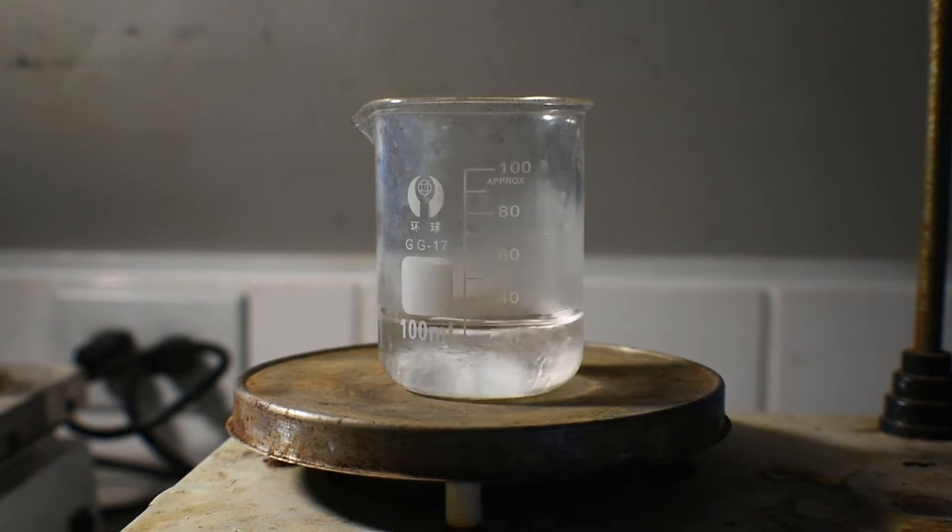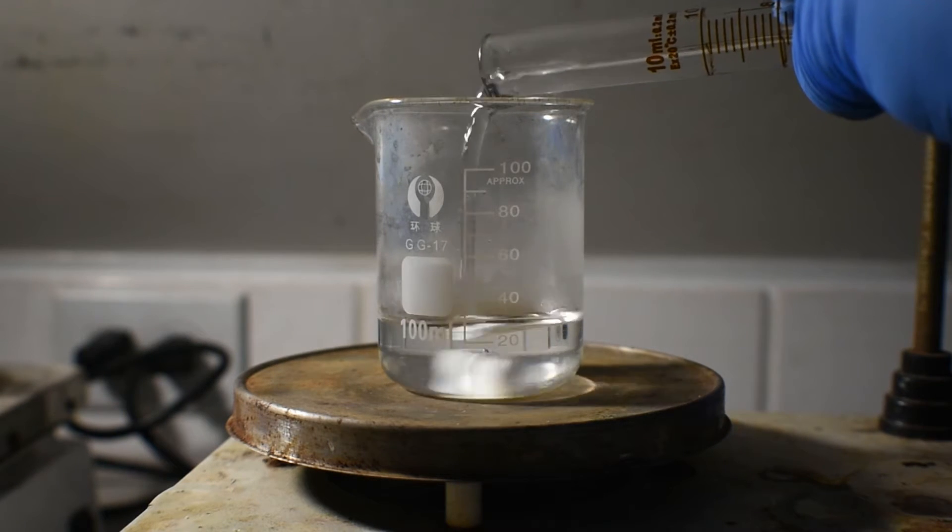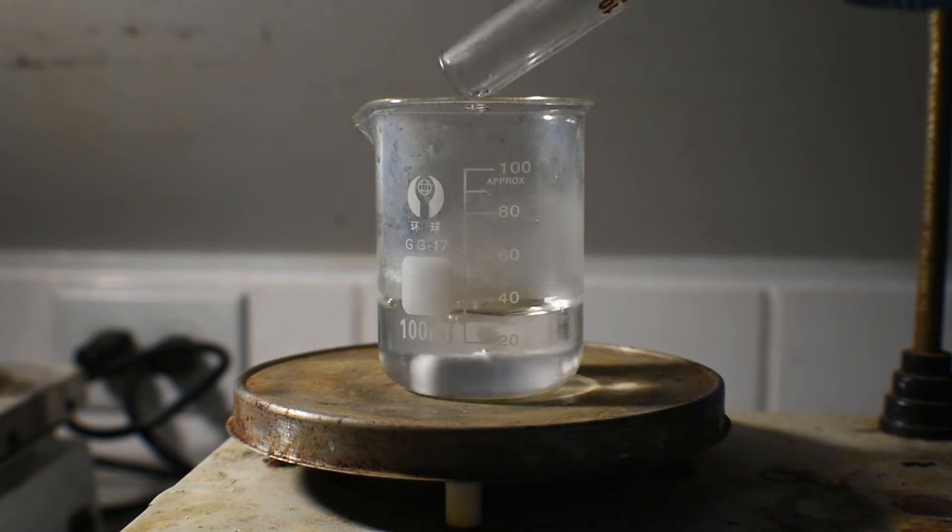This is stirred, and the ethylenediamine should go into solution. The graduated cylinder that the ethylenediamine was in is now washed with the distilled water, like I mentioned before. This is added to the rest of the solution.